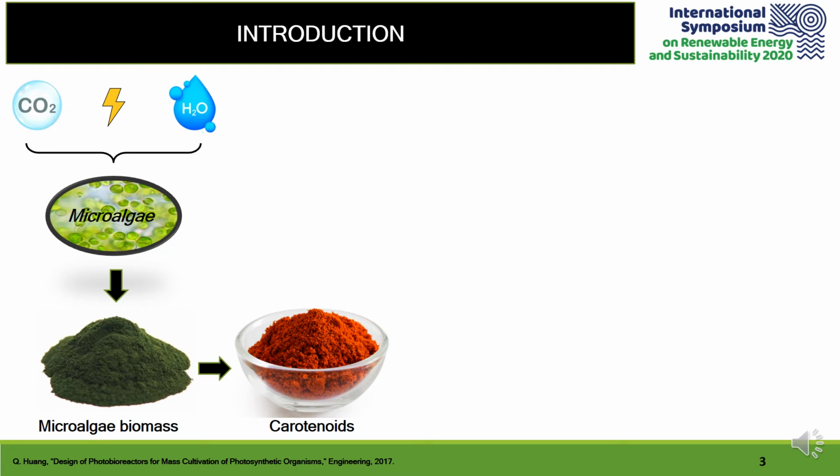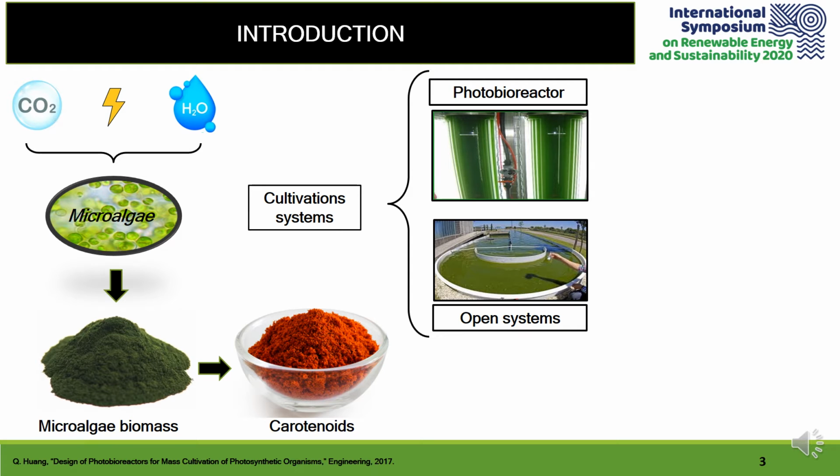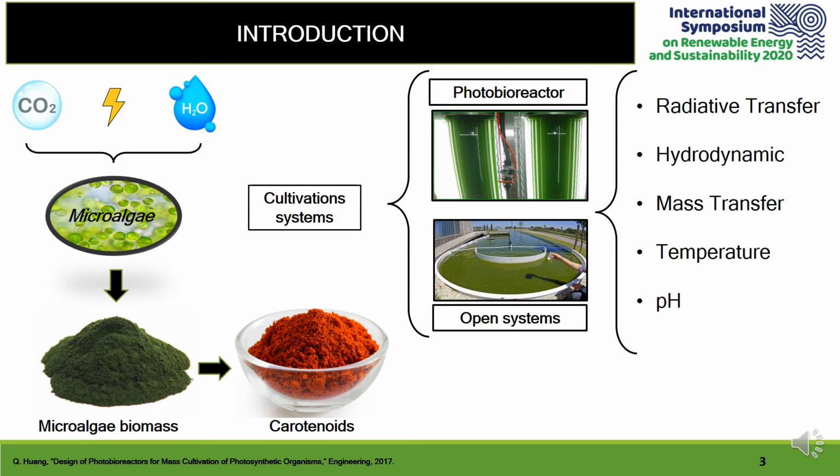These microorganisms are mainly cultivated in closed systems called photobioreactors and open systems such as raceways. The main factors to consider in the design and control of these systems are radiation transfer, hydrodynamics, mass transfer, and temperature and pH conditions. This research focused mainly on radiative transfer phenomena, with the objective to describe interaction of the light with suspended microalgae.